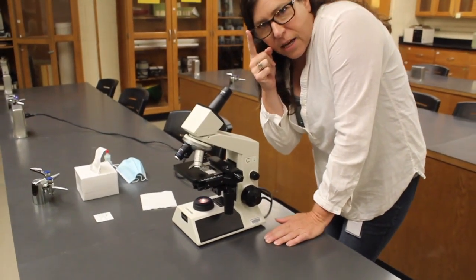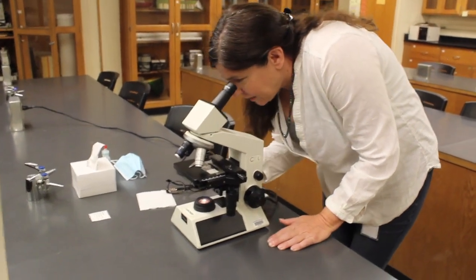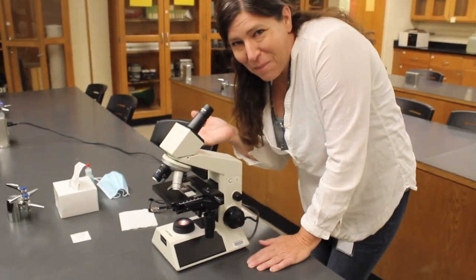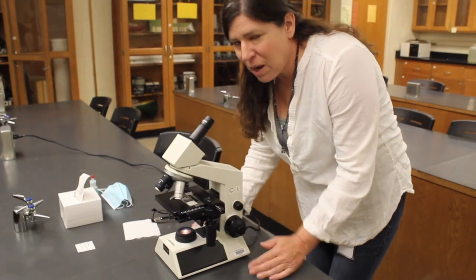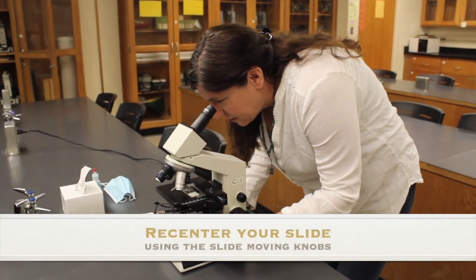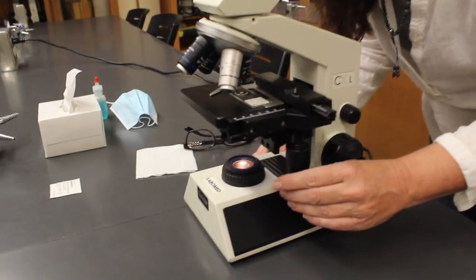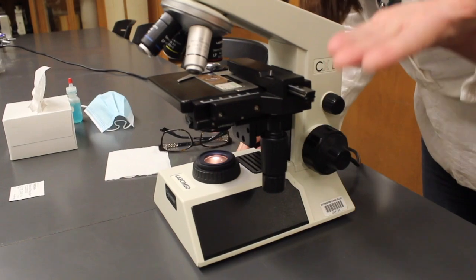If you wear glasses like I do, it might be a good idea to take them off at this time. So I'm looking in here, and I did a pretty good job. That E is just a little off center. I want it to be perfectly centered. So I'm going to move my stage down, up. It looks like up to you, but in here it looks down. And now it's centered to my eye.